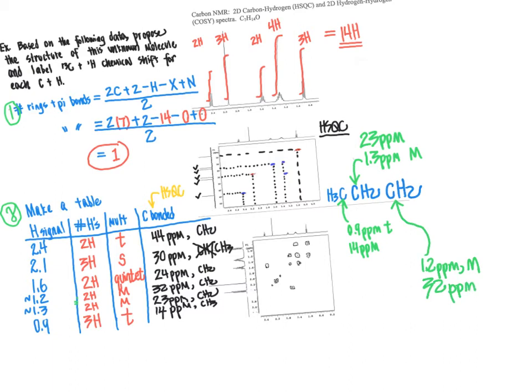And the reason I plugged this group in here was the CH2 group right here was part of this multiplet, and it was vicinal to the CH3 group, and then it needed to be coupled to something else. When we looked at the COSY spectrum, we didn't really see anything that lined up perfectly with the 1.3 ppm signal, except for looking right at this diagonal.